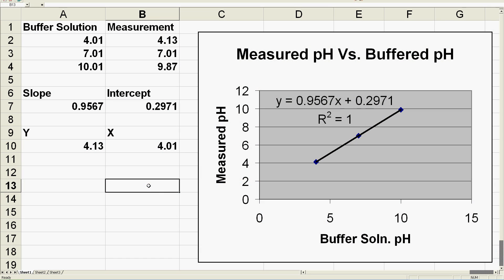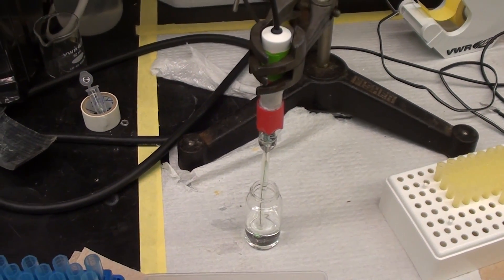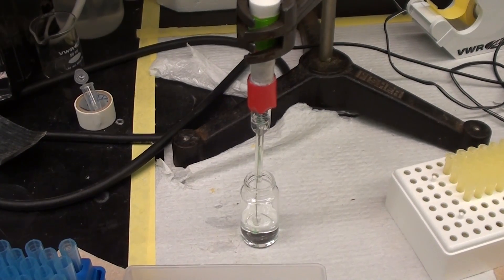Now as great as the calibration curve is, it can't make a bad electrode into a good one. So the electrode itself should be of high quality if you want to get high quality data. Garbage in garbage out as they say.